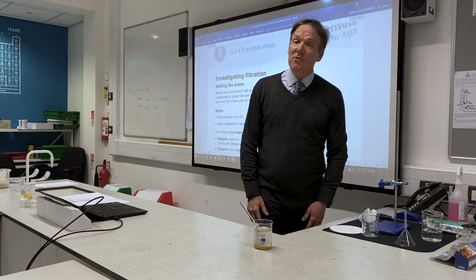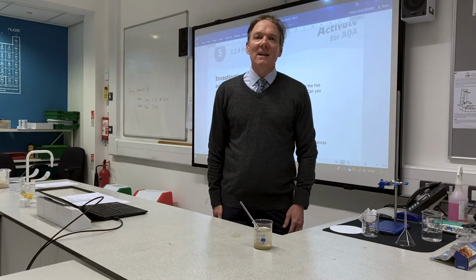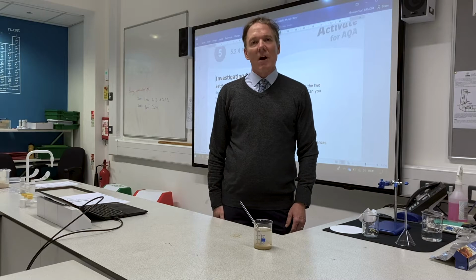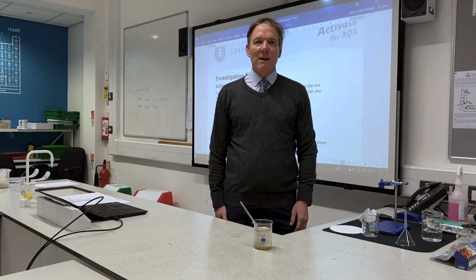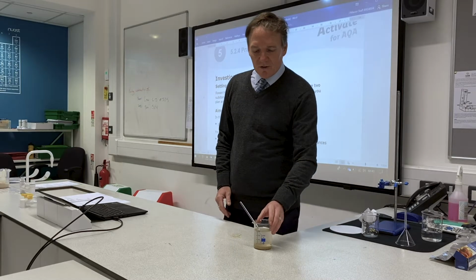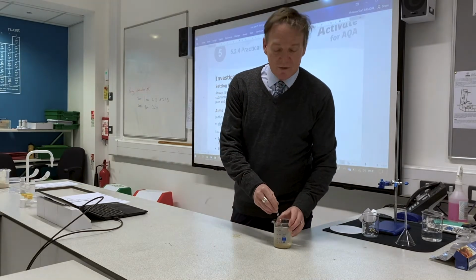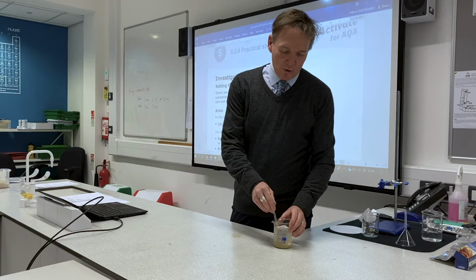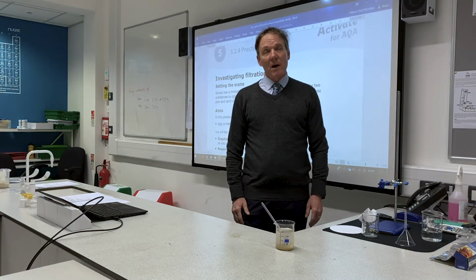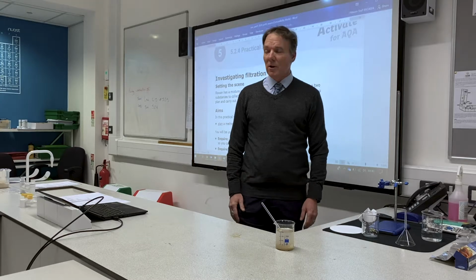Now, filtration is one of the basic separating methods or techniques that you need to learn to be able to separate mixtures. And today we're going to separate this mixture that we have here of some sand and salt in water. Now, to do this, you're going to need the sheets that are uploaded for you.